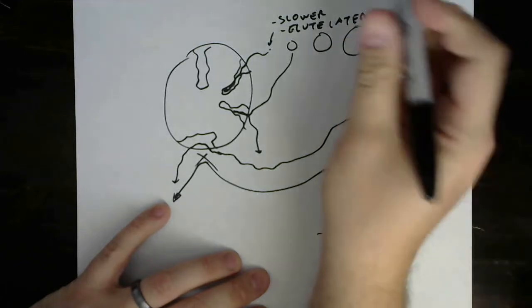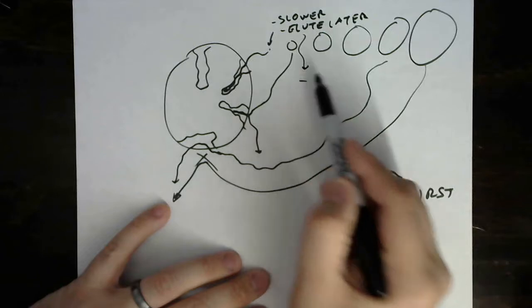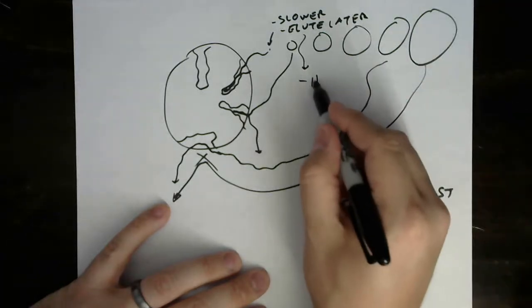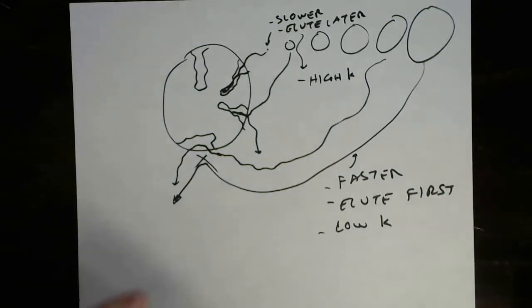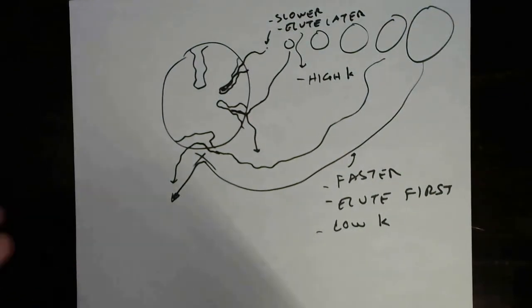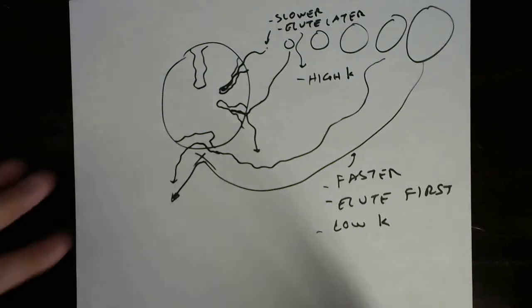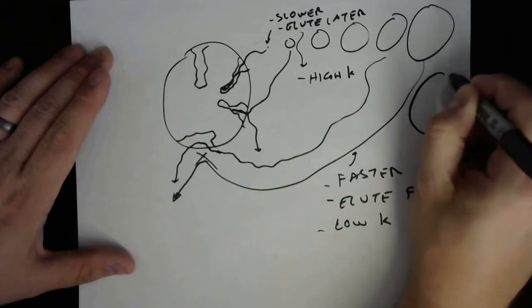And as such, they have high values of lowercase k. And so the example that we talked about last time, the thing that gives rise to this concept of total inclusion and total exclusion peak is if I take another particle here, a really, really, really big one.